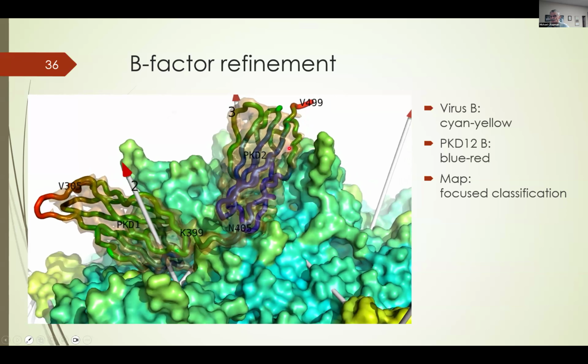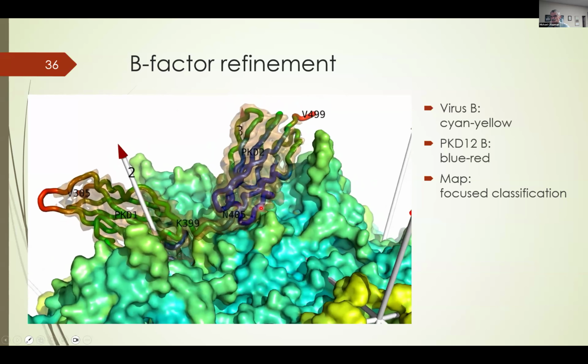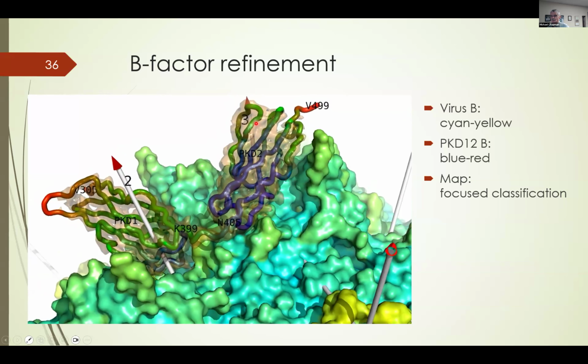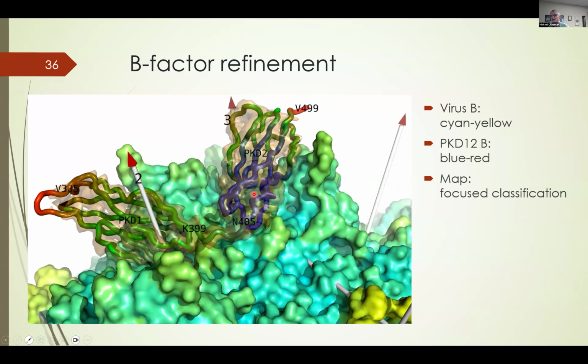And it's as if the interaction is stabilized at the surface here, but as you get further away, there is perhaps a larger and larger pivoting around the binding site.